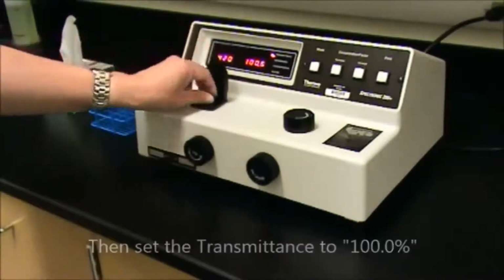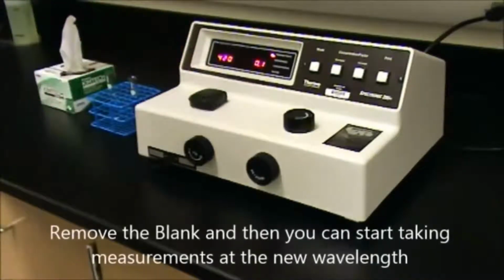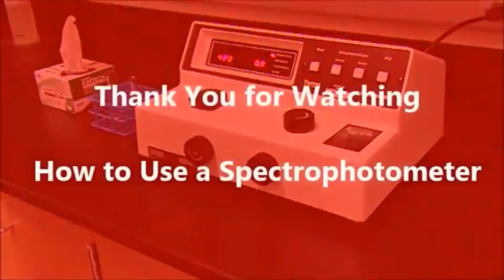And then after that's complete, you can go ahead and put your sample in to read the absorbance or transmittance at the new wavelength.